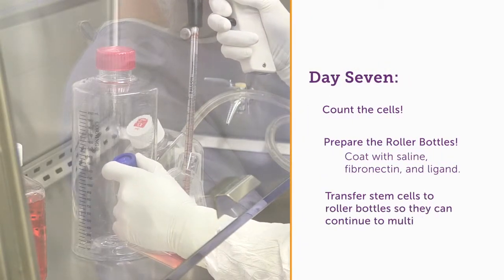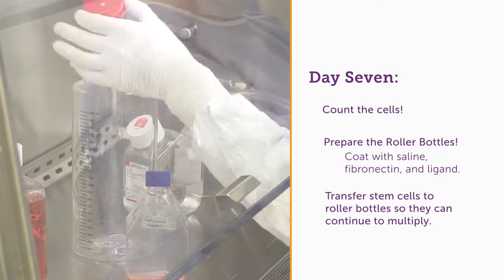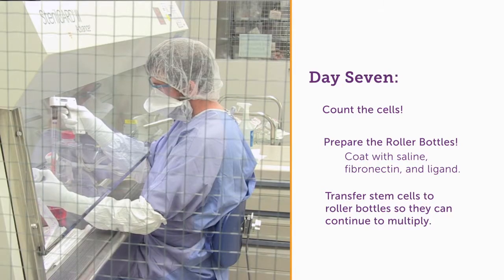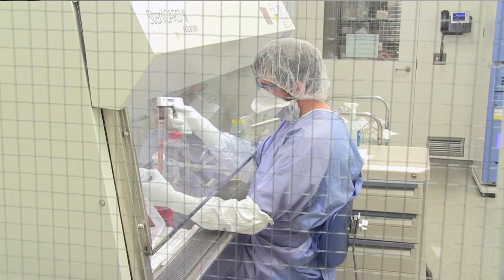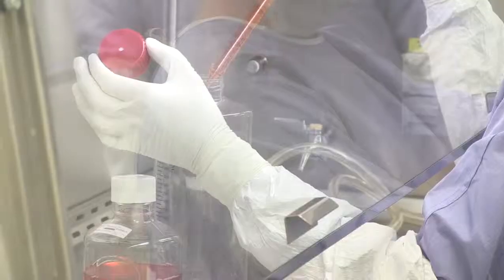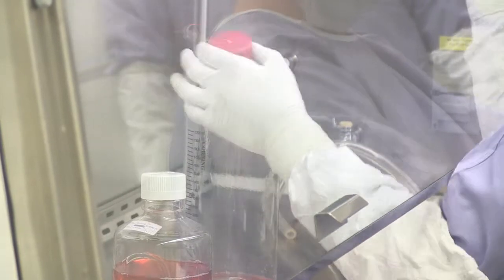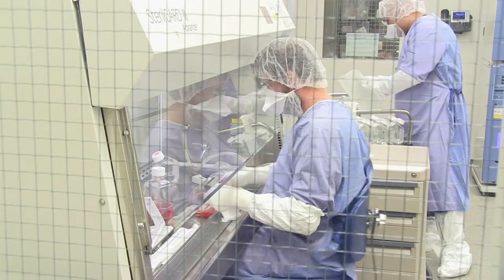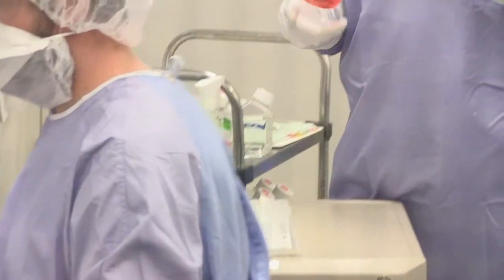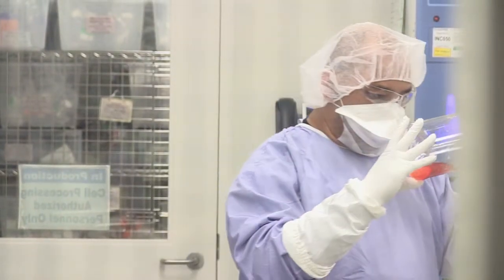We transfer our cells into the roller bottles, and the roller bottles actually sit in racks in an incubator that roll and revolve at a very slow rate. What that does is it allows our cells to come in contact with the ligand that's coated on the plastic surface of the vessels, but it also keeps the cells in motion — which is actually a pretty good way to grow cells because it prevents them from piling up on top of each other or even suffocating each other when they grow fairly dense.